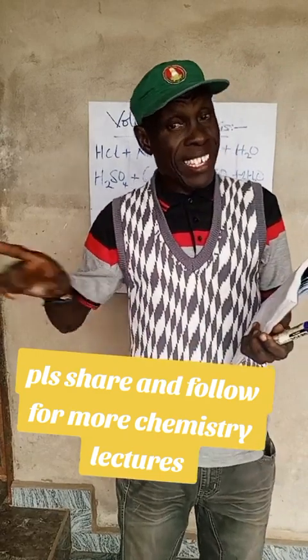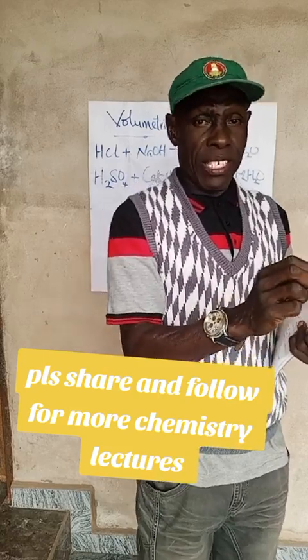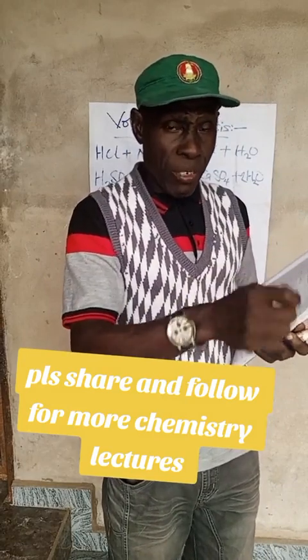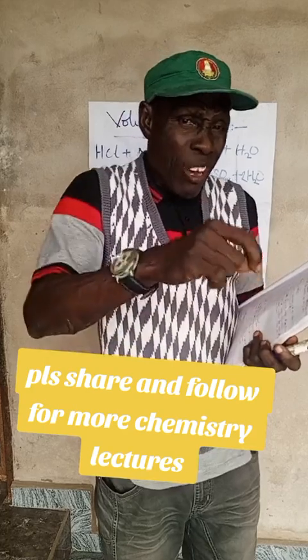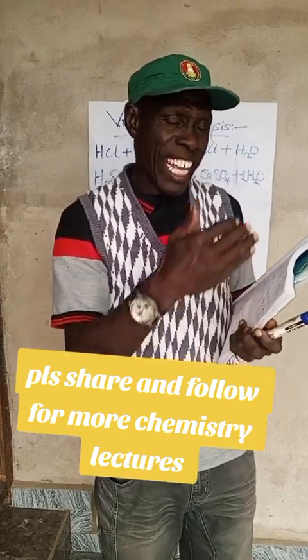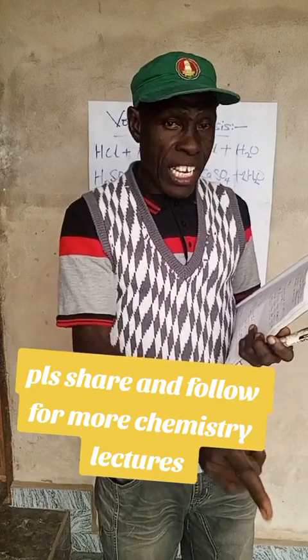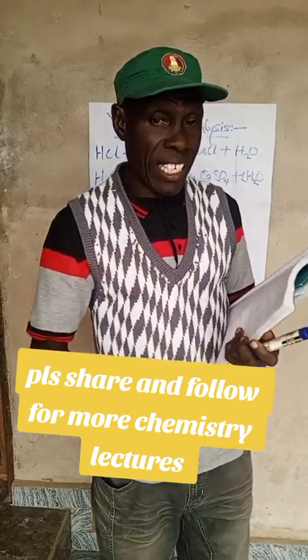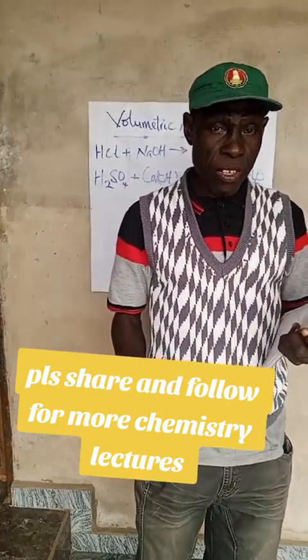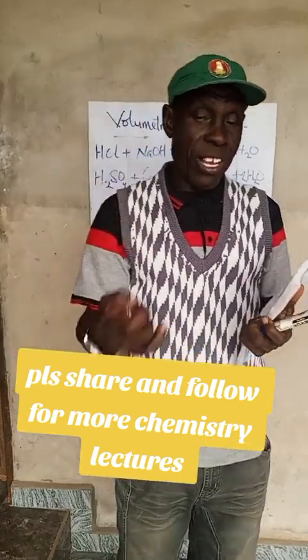So in your second titer, when it comes near that level, you stop the burette and go drop by drop, drop by drop. It doesn't matter whether I take time, so that you get the accurate volume of acid used, so that at a time, one drop of the acid will give you the end point. You will do that 3 times. We call it titers, 3 titers. Then you add all the sum together, divide by 3 to get the average. Then you can now go further for calculations. So that will be another time.